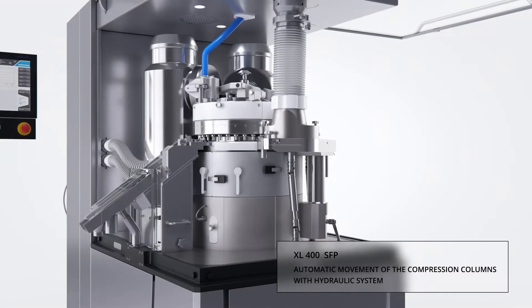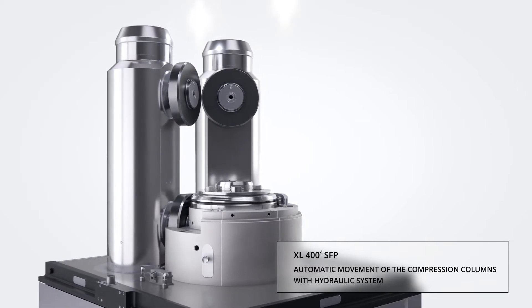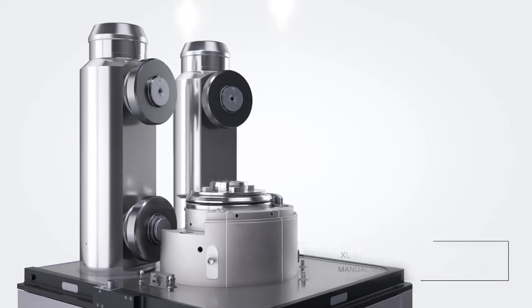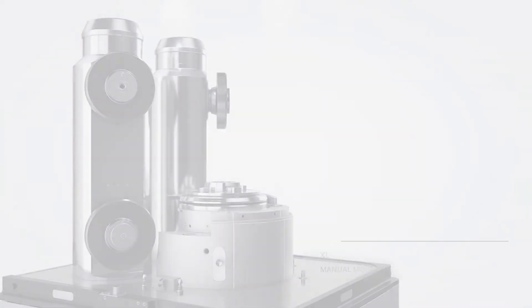The proven KORSCH compression column concept is implemented in the XL 400⁴ SFP in the form of two adjacent 100 kN compression stations for pre- and main compression. These columns retract automatically using a hydraulic system to facilitate cleaning and turret exchange.